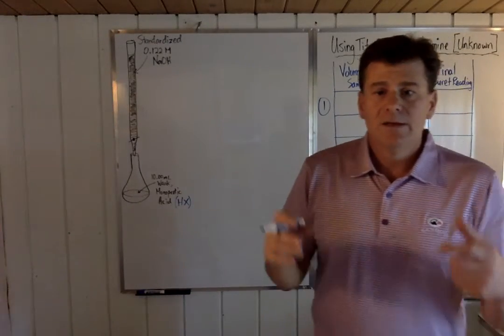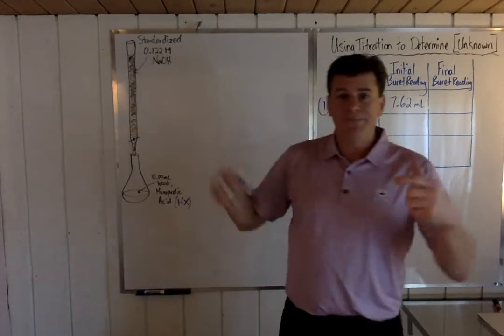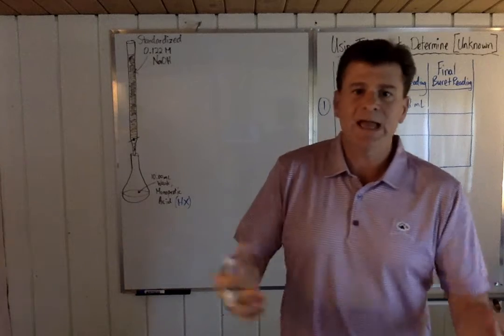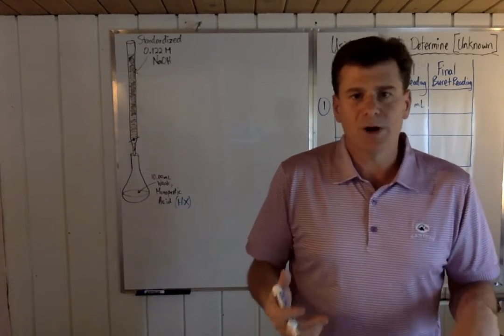Okay? So I'm all ready to go with my burette. Then I've got to get my sample down there in the Erlenmeyer flask. So I take a sample of my unknown weak monoprotic acid.